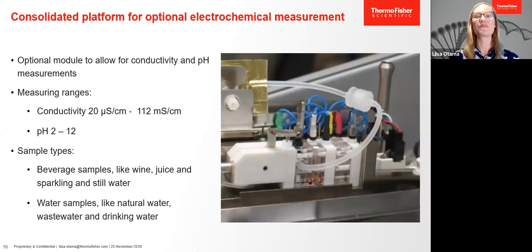So speeding up. pH, I already mentioned. This is an optional module which can be used for pH and conductivity.